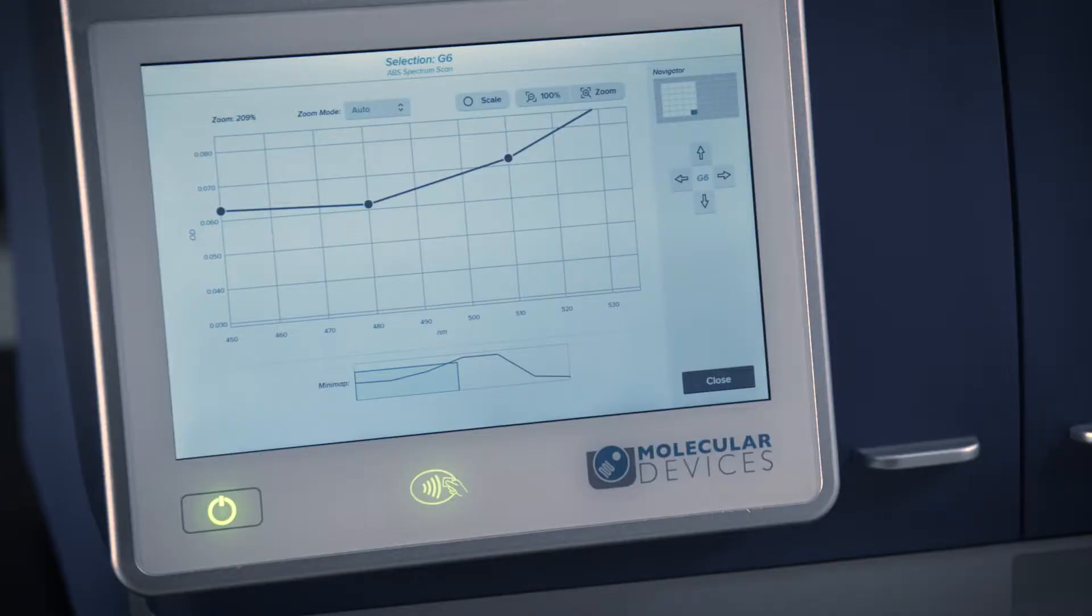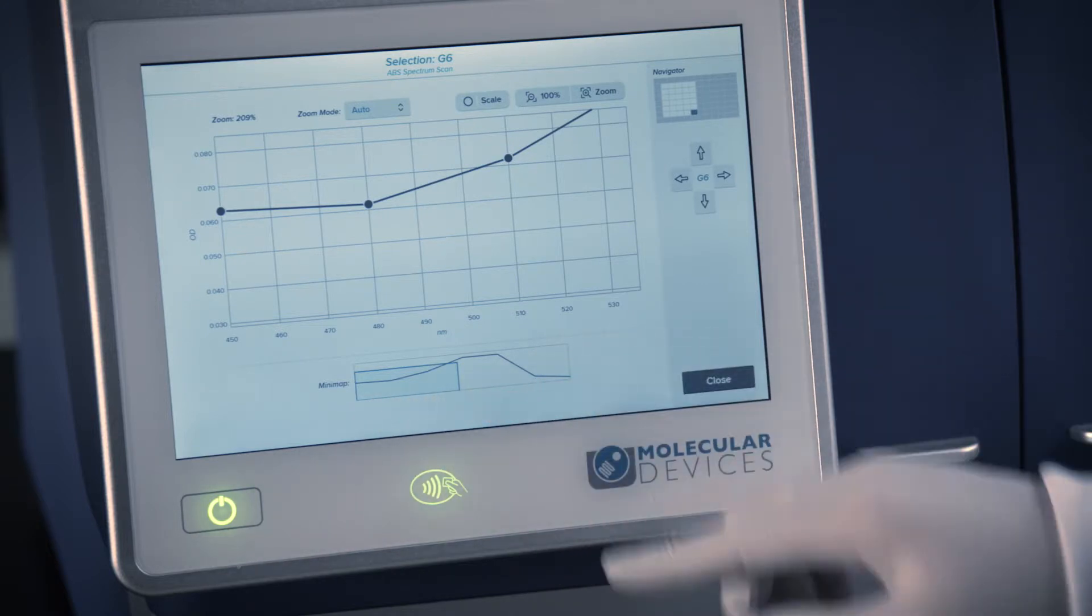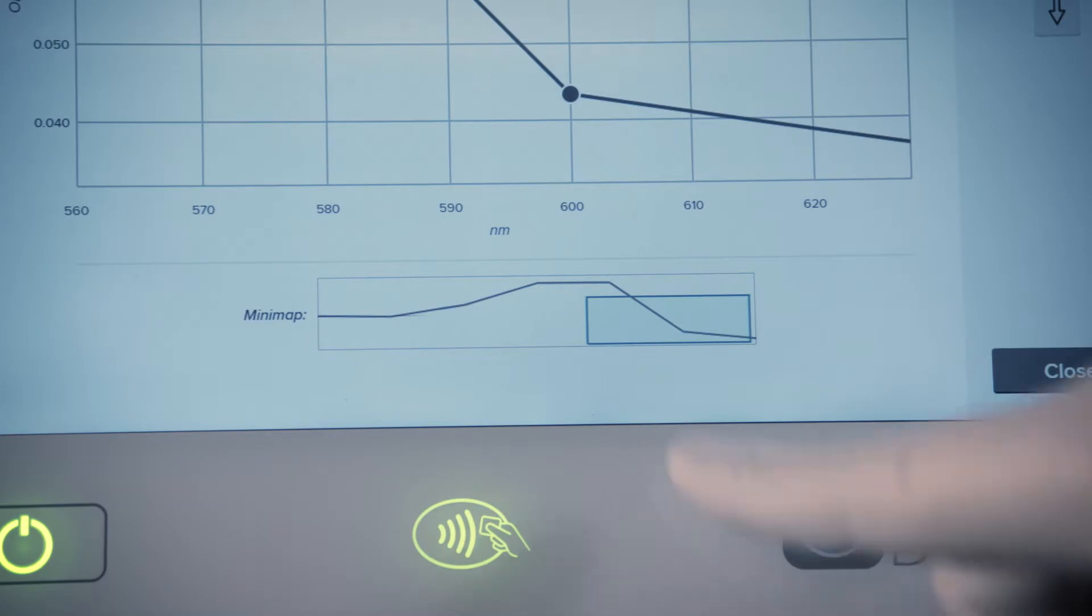You may also use the zoom and scale features located at the top of the graph. When zoomed in, the mini-map will show the section of the graph you're looking at. The mini-map can also be used to navigate quickly to different sections of the graph.